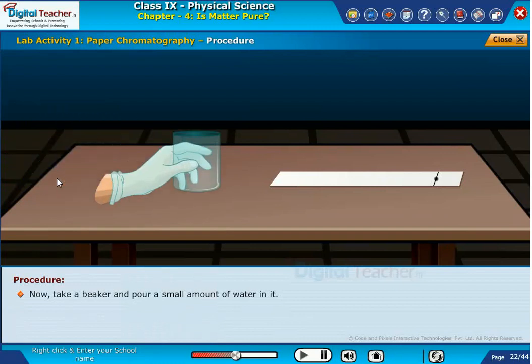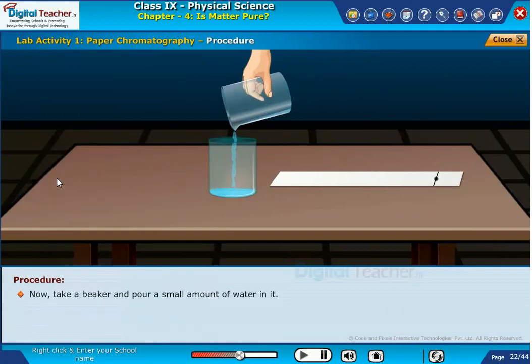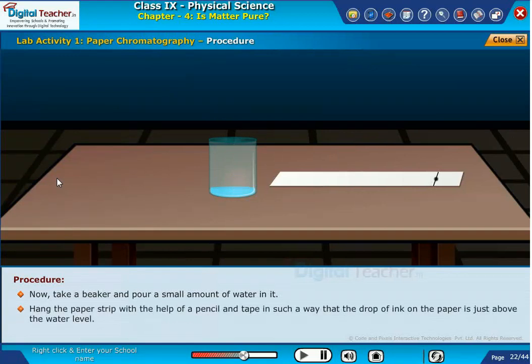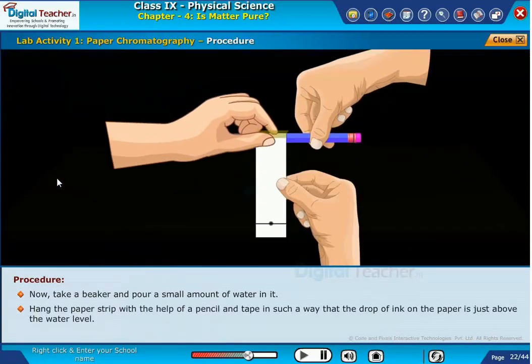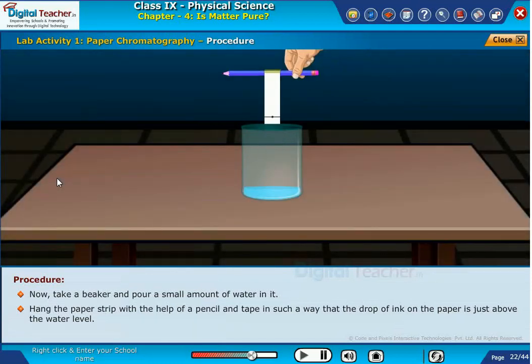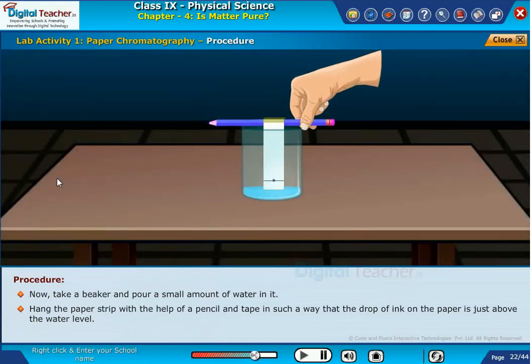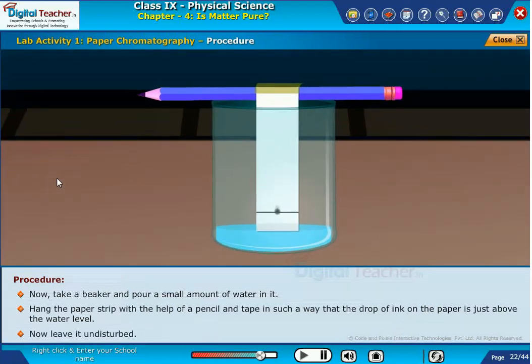Now take a beaker and pour a small amount of water in it. Hang the paper strip with the help of a pencil and tape in such a way that the drop of ink on the paper is just above the water level. Now leave it undisturbed.